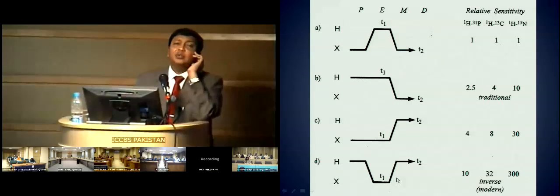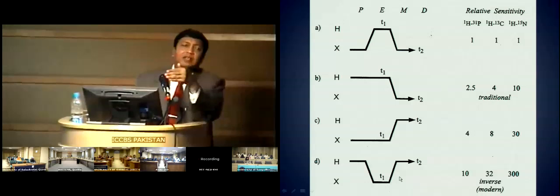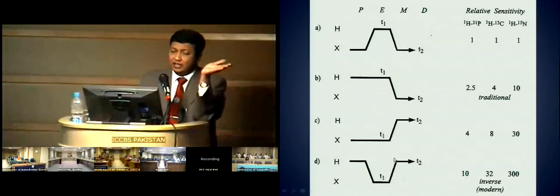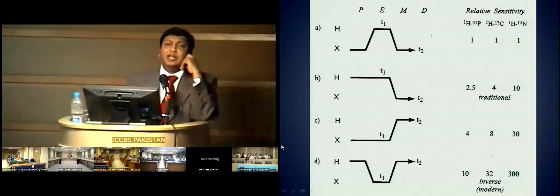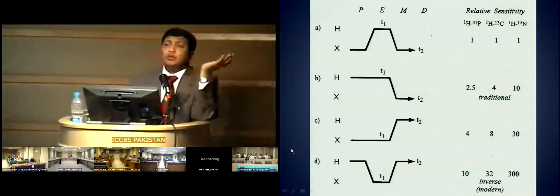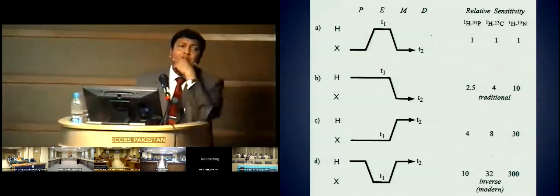So it means that you strengthen the carbon and then move it to the proton, not directly, but you first do an INEPT. That is the reason why I keep telling you that INEPT is an integral part of lots of NMR experiments now, even in INADEQUATE also.